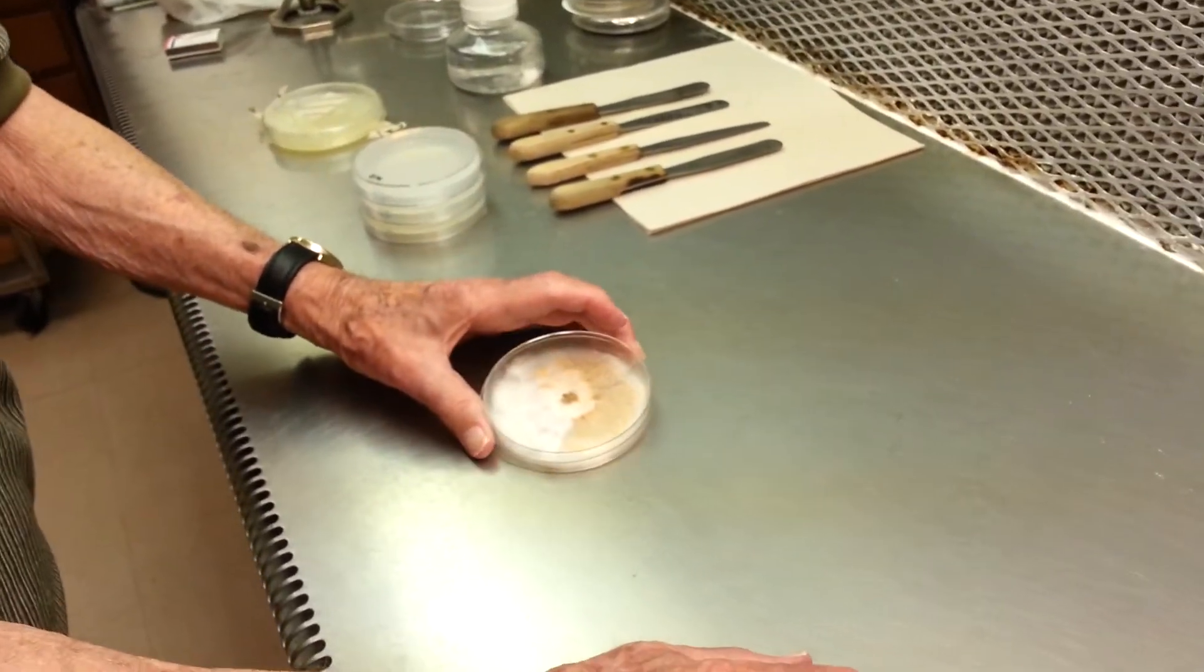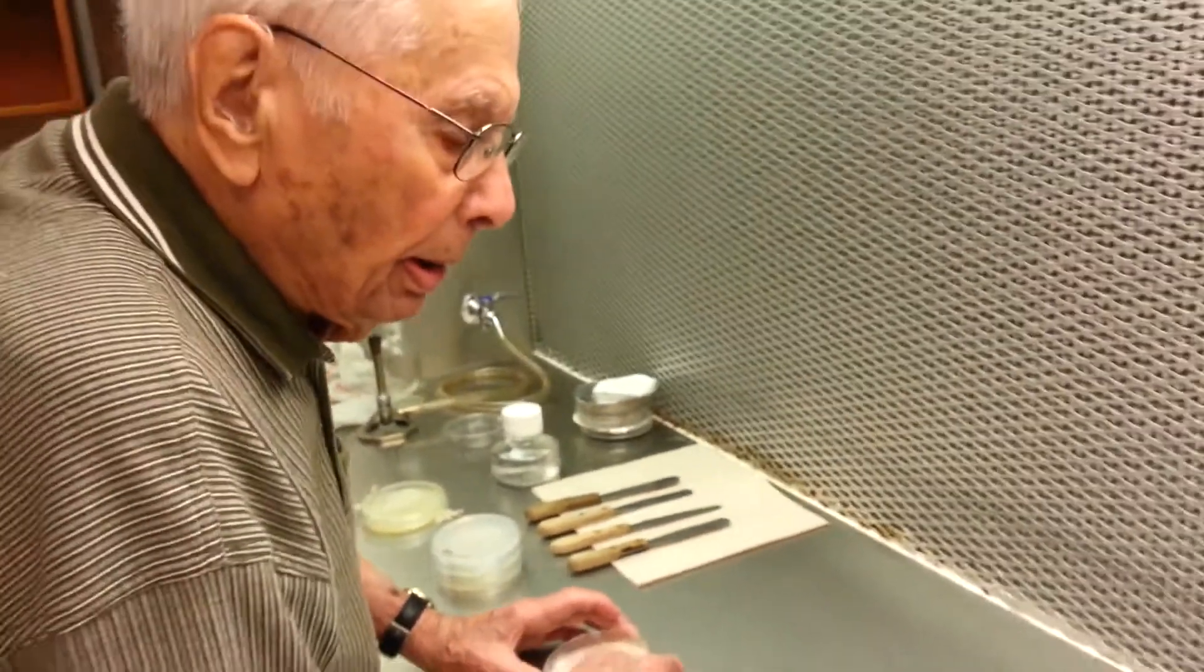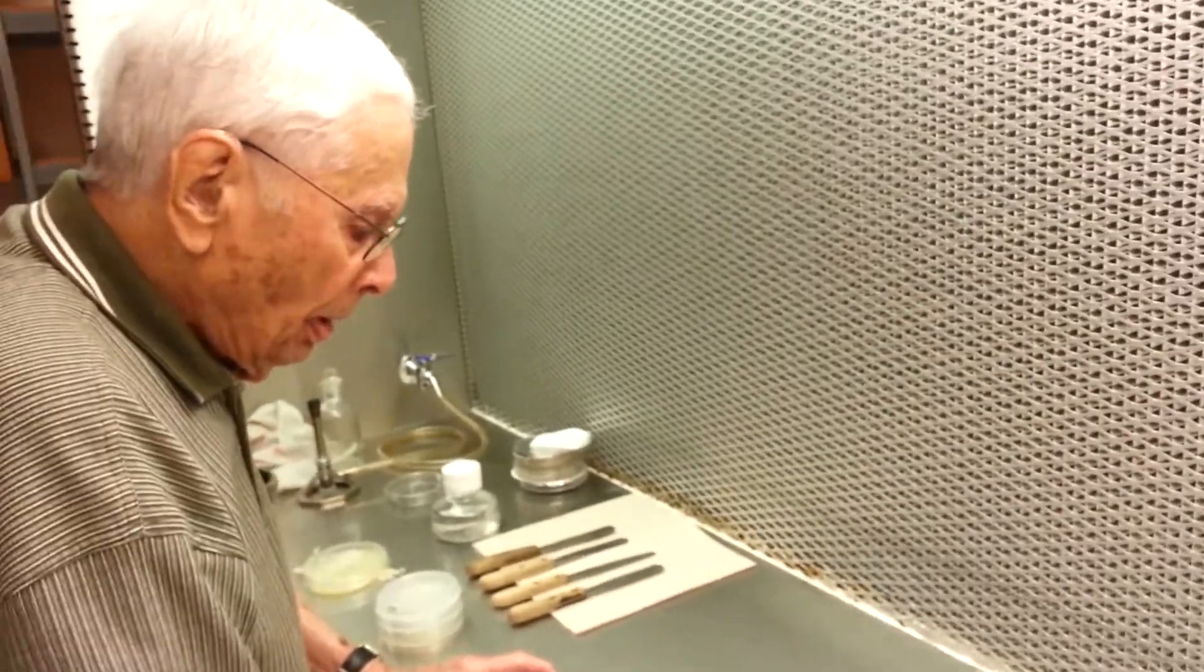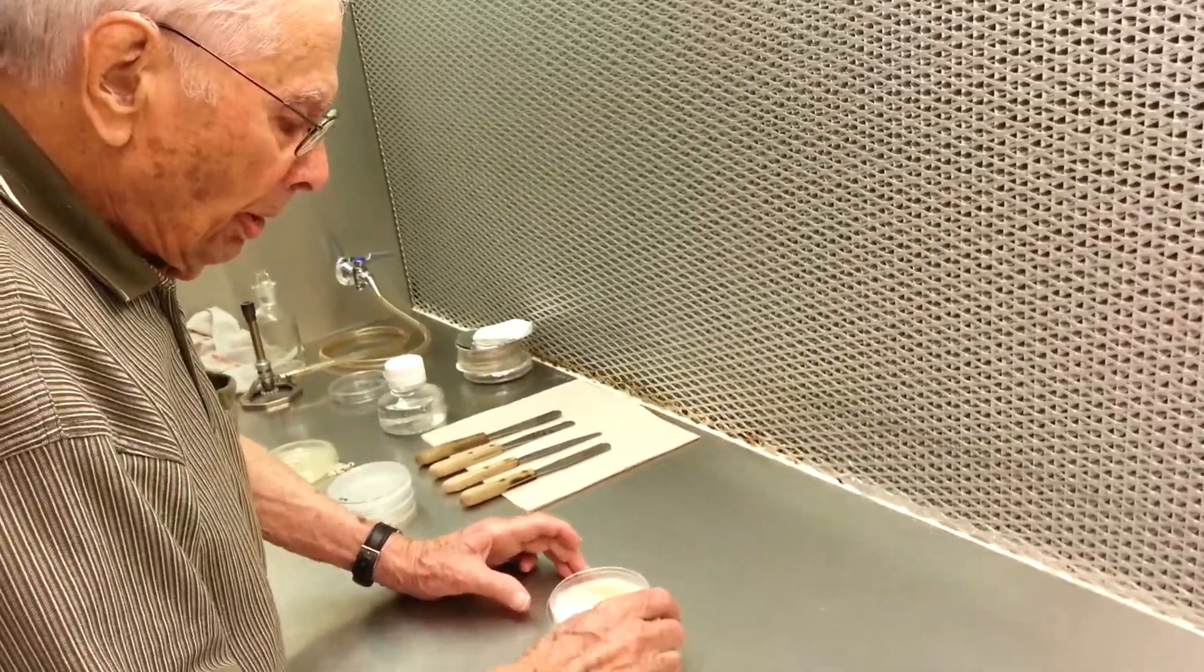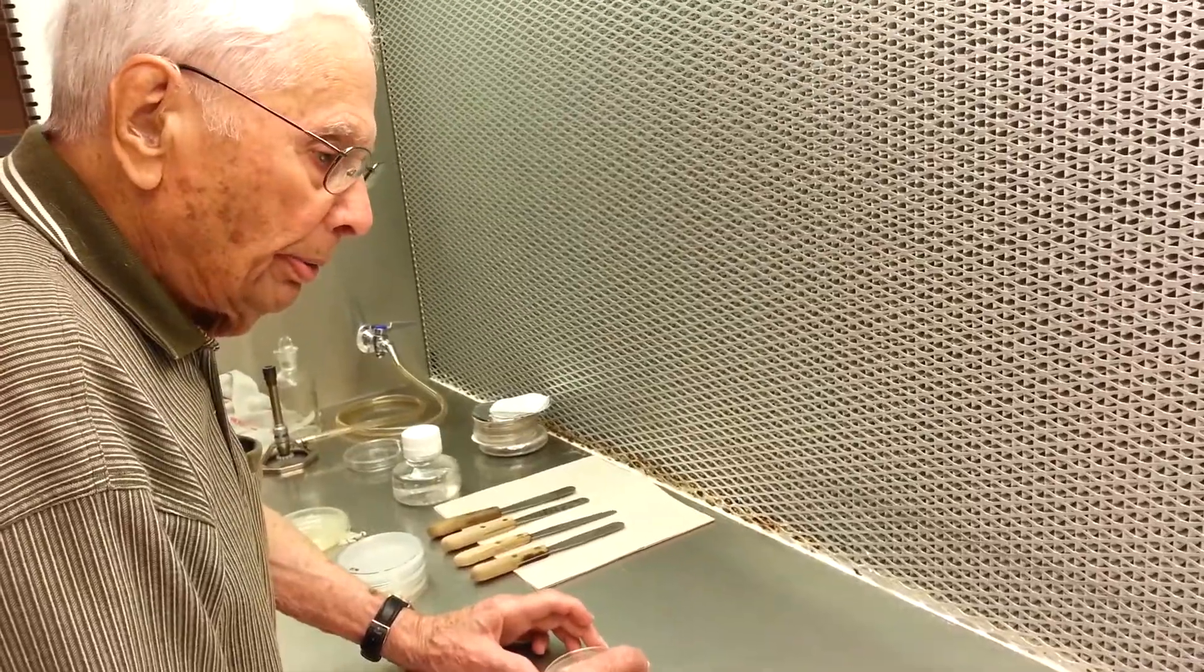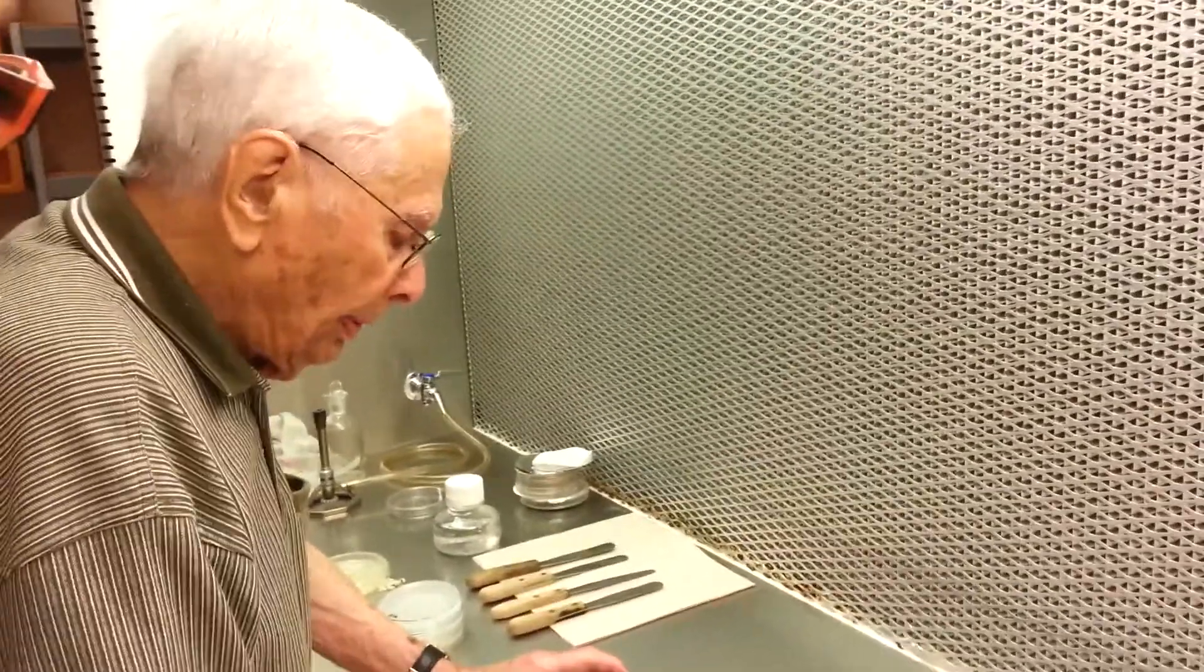Yes, there are two methods of purifying contaminated fungal cultures. One of them is using the water agar method, and the second one is using the Vaseline method.